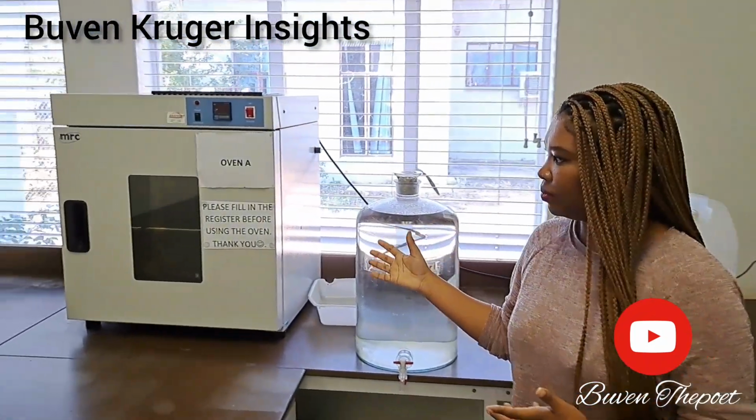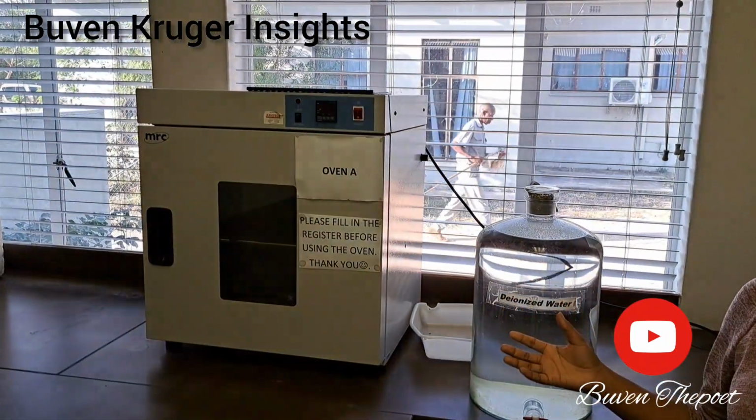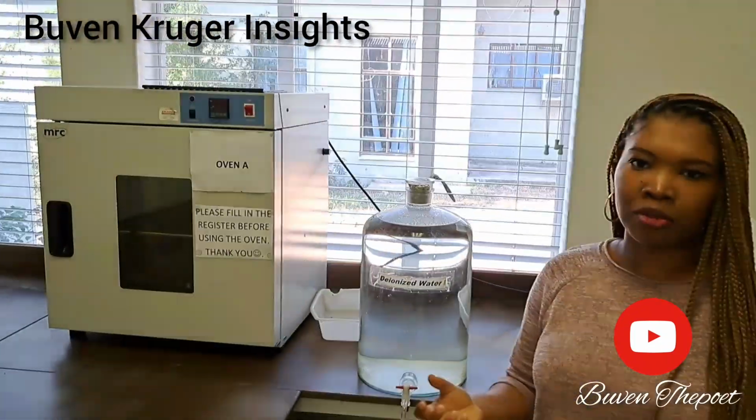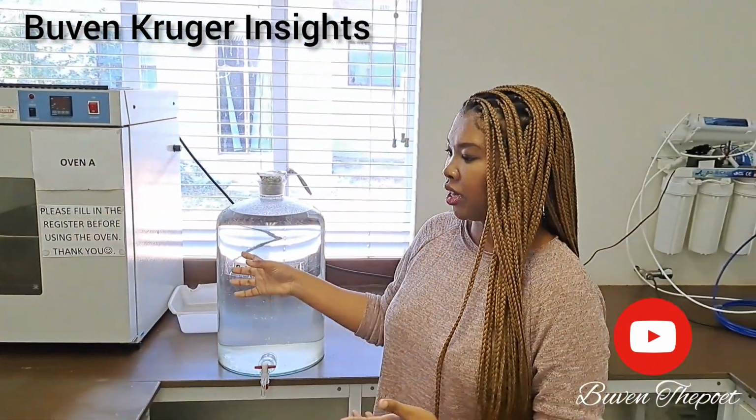And this is an oven. This is where they put the vegetation. Let's say you have your grass and they want to dry it for whatever research purposes they have. They will put it in here.